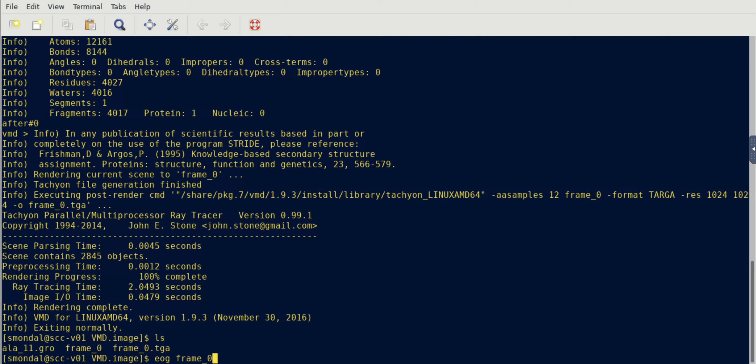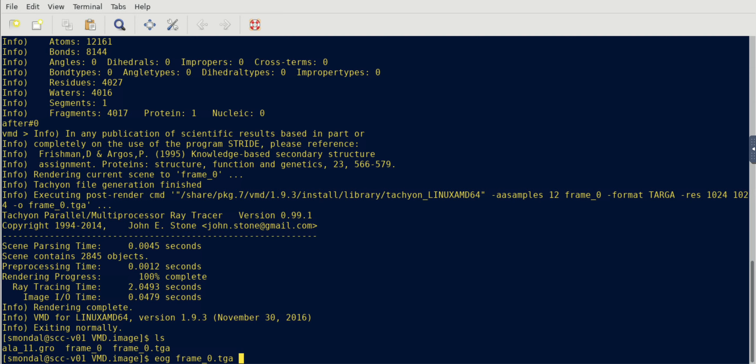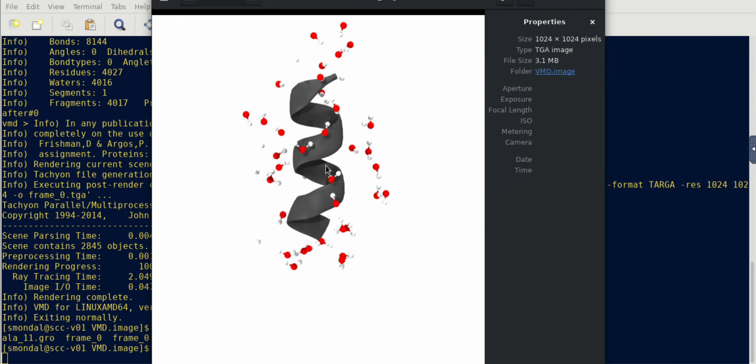So with that being said, let's start rendering. Once the rendering is complete you can close it, and you can see that frame0.tga file has been created.